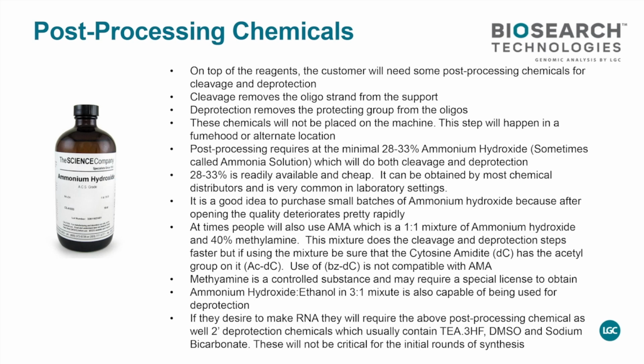As I say, ammonia is readily available. It's cheap. I would recommend you buy smaller bottles, refrigerate them, and after opening it a certain amount of time, you dispose of it or send it to biology labs so they can make some buffers.